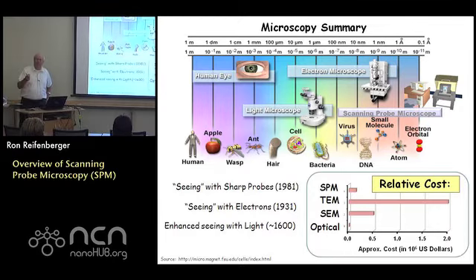They were very simple devices at the beginning, but they have evolved considerably, and so nowadays just about every lab at Purdue has an optical microscope somewhere that you can use to see things below about a millimeter. The best optical microscopes typically end around a micron, right? 10 to the minus 6 meters. If you want to see below a micron, you need another way of seeing.